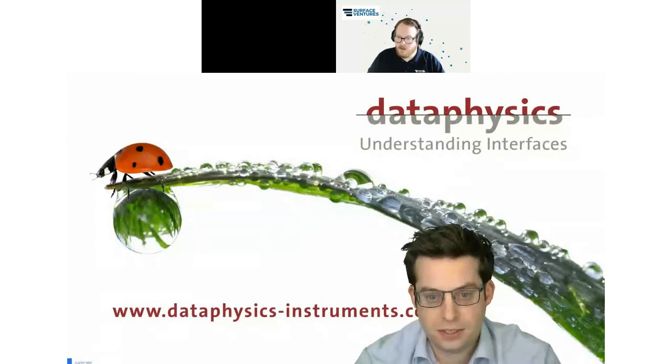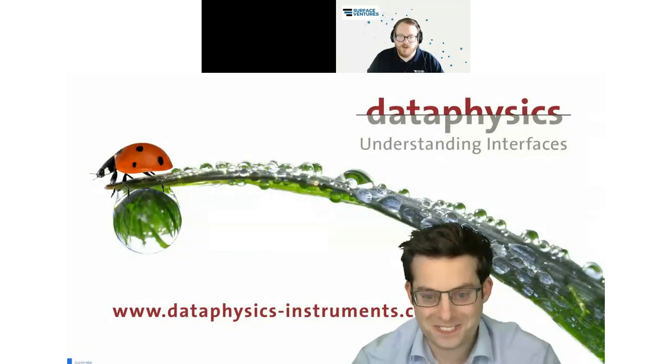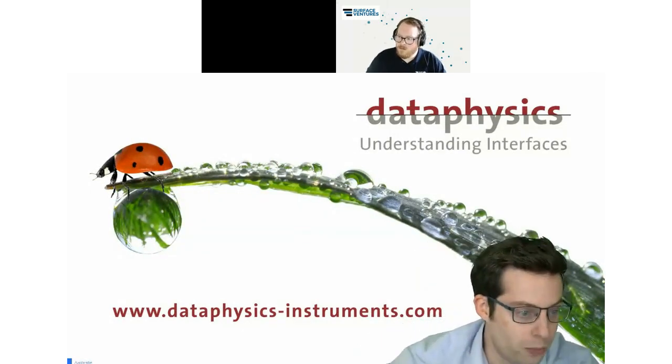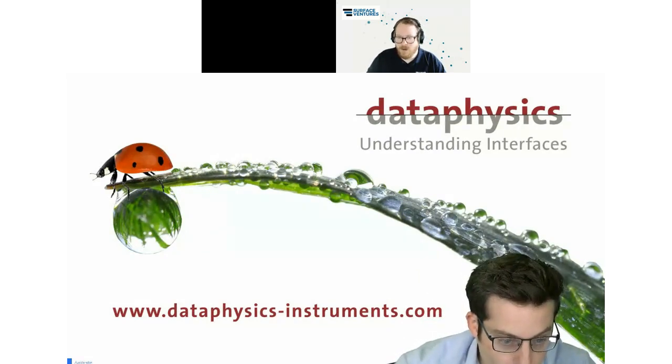Okay. Yeah. Another one. Why in the du Noüy ring method is density needed? What is the relation or equation of density with this? Okay, this is a good question, but for this, I quickly open one other slide to explain it a little bit to you. Just give me 1 second. Brilliant.